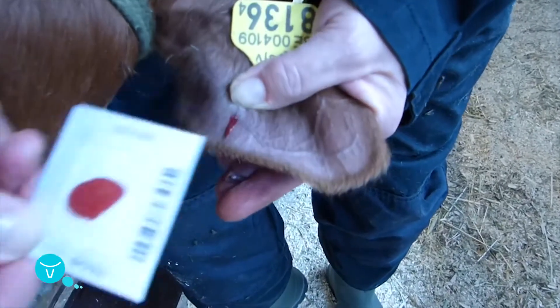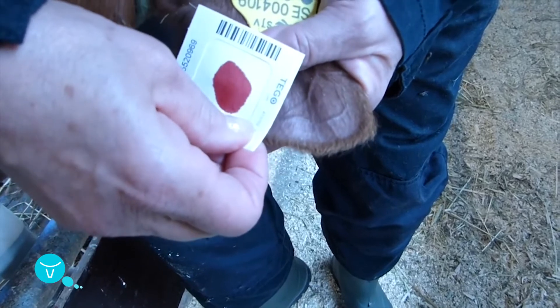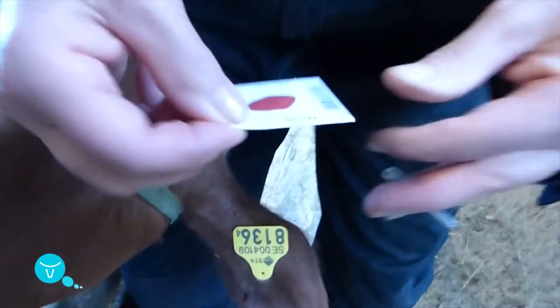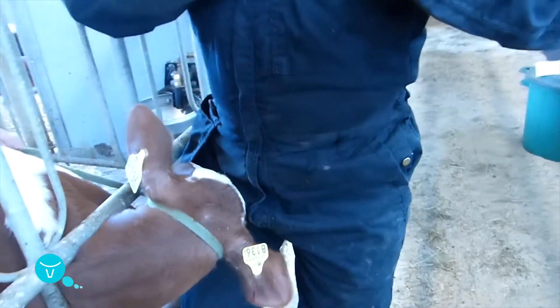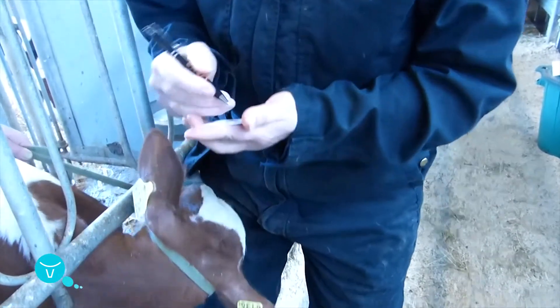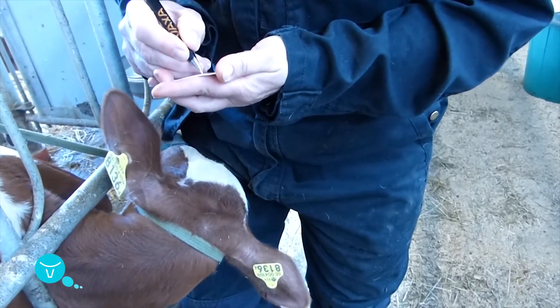Ensure that you collect enough so that the blood spot is approximately 2cm in diameter. Write the full National Animal ID number on the paper.